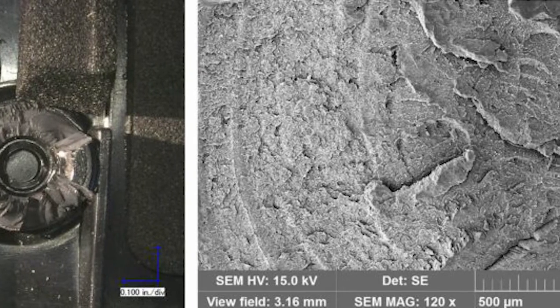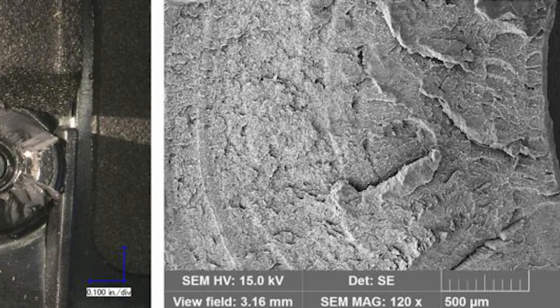The key thing I think that this workshop will help with is avoiding plastic component failure. That's something that certainly no one wants to have. No one wants to have a field failure. And so by understanding those viscoelastic properties, temperature dependency, time dependency, and frequency dependency, we can avoid plastic component failure.